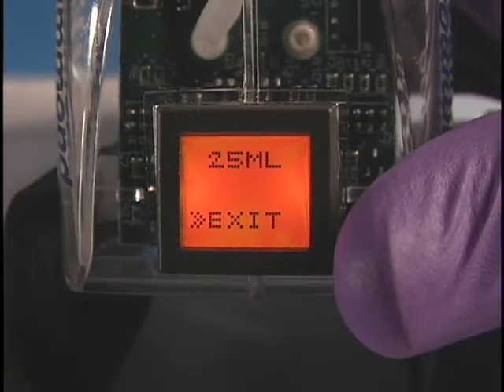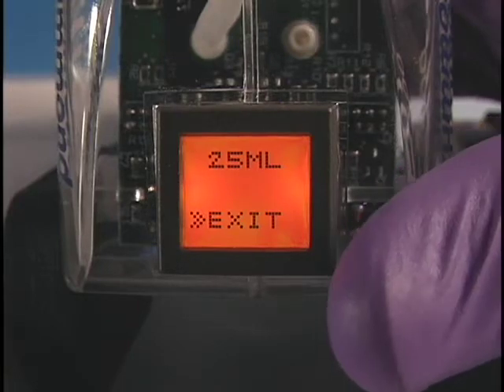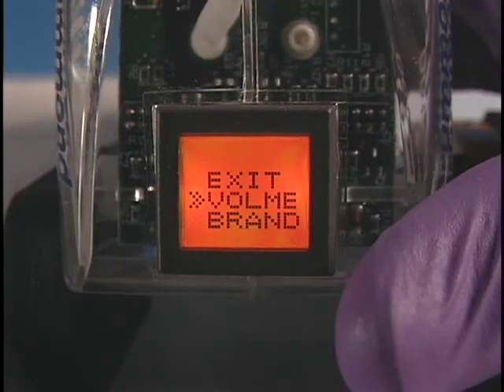We're going to use a 25 milliliter pipette. Press the Menu button to enter pipette size.